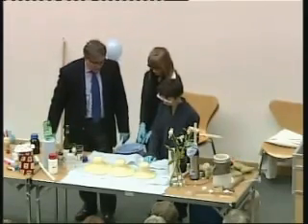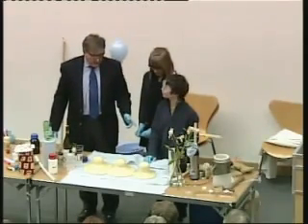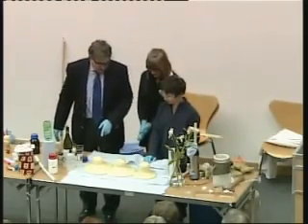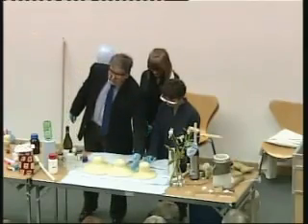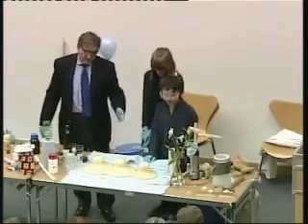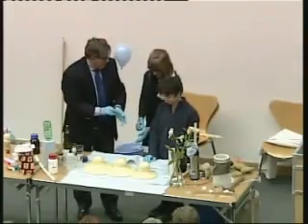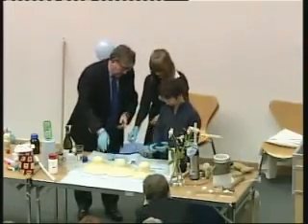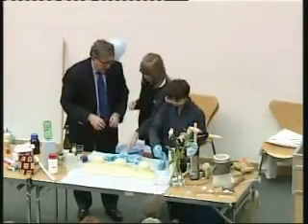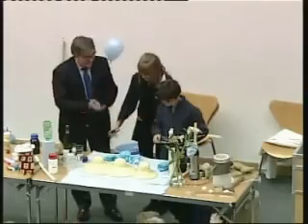All right, I think we're probably done now. So at the end of this, how are we going to do this? There are 2 of you and 3 of those, and I don't want one. If we only do 2, it usually looks quite vulgar, so I suppose I'd better... Maybe this is a better experiment. All right, I think we'll have to leave it, but you can have a look at the end. You can take it home if you want to, all right? So pull your gloves off carefully, because one of these materials is not very nice. All right, just peel it back over and leave it down. There you go, good. Well, I think we get a round of applause for the loser, don't we? Thanks a lot.